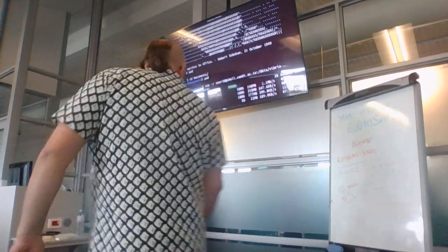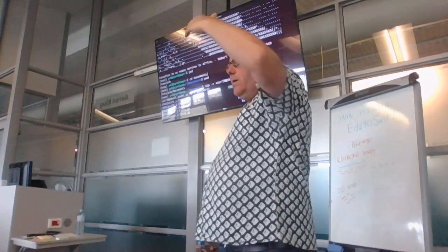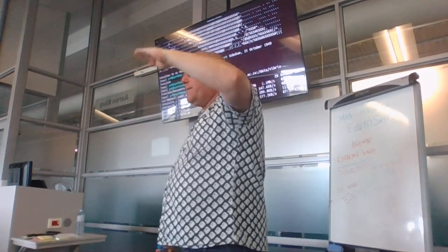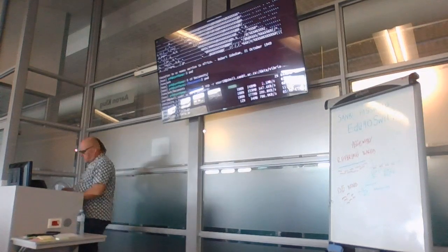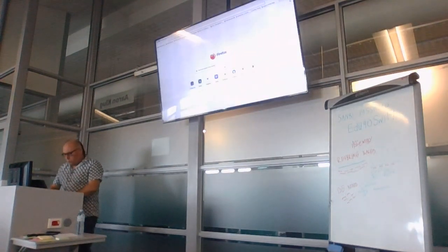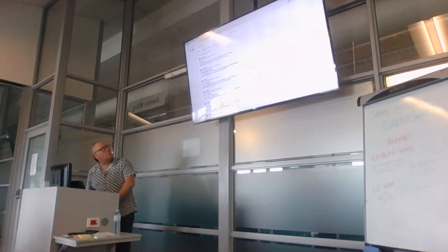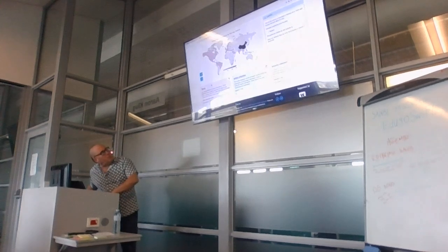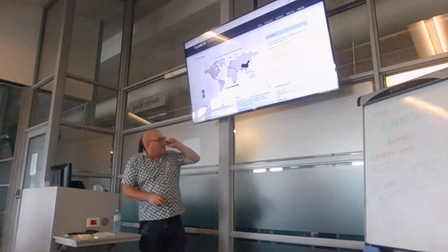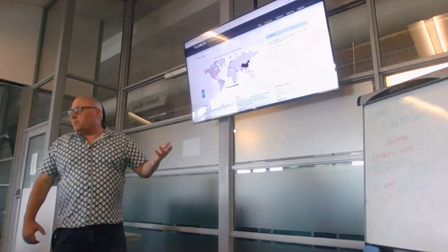No, marker gene databases are more similar to this. Because your marker gene database is going to say these genes, GyrB, XYZ, so which genomic pattern do you have at this, so if we look at, for instance, classic MLST, I think they've got it illustrated. So this is the PubMLST page for Vibrio, the Vibrio genus, okay?